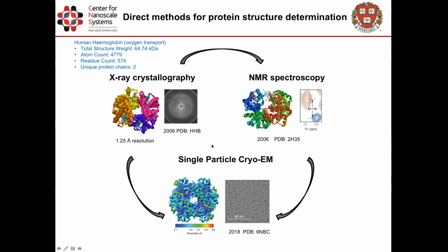All these structures, as I said, are deposited in the Protein Data Bank, and you can access them. They are free for access, and you can actually observe all these images. Now, all these methods have benefits and drawbacks. In X-ray crystallography, you do need to have quite well-ordered three-dimensional crystals, which is not exactly a physiological or native environment, and you do not record images. You do have a diffraction pattern, and one of Max Perutz's achievements is that he did the phase definition. You have to define the phase, because in a diffractogram you have only the amplitudes, or the square of the amplitudes, which is intensity.